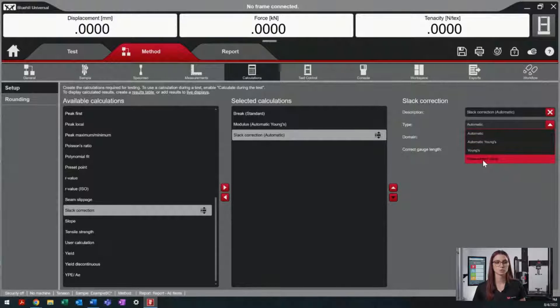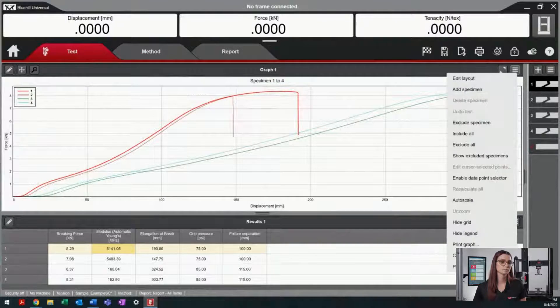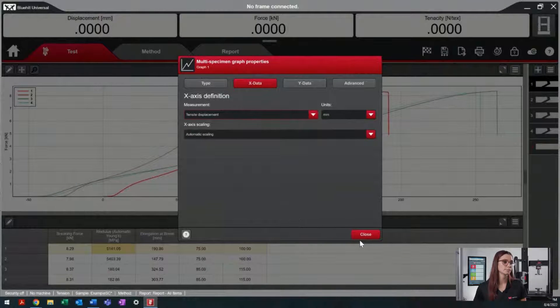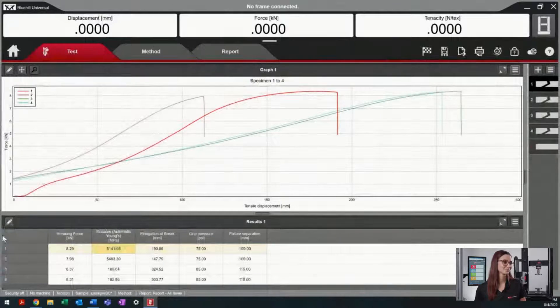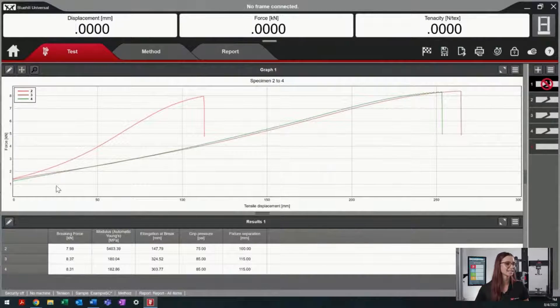Automatic and measurement value are our two most commonly used. Automatic will automatically adjust your curve. This is a good time to point out that the curve will not adjust unless you're using the tensile displacement. So now that we can see the slack correction, we see that the start of our test is beginning at a maximum load of 1.5 kN.